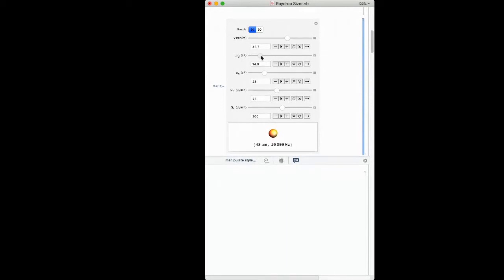If you increase the viscosity of the dispersed phase, you increase the interfacial stress and you make smaller droplets. And the same if you increase the viscosity of the continuous phase. You make smaller droplets, and then you can reach very high frequency. If you push the flow rate of the continuous phase, then you also make smaller droplets at higher frequency. And you can push the flow rate of the dispersed phase, then you increase the frequency.